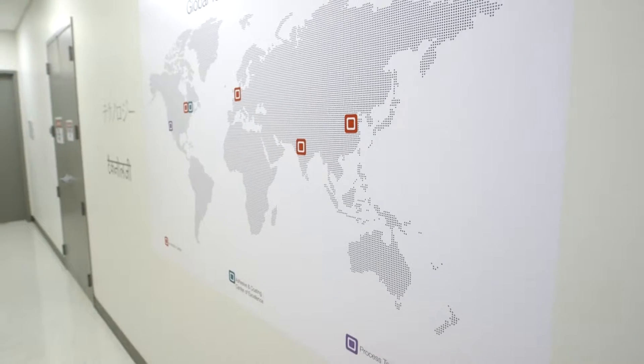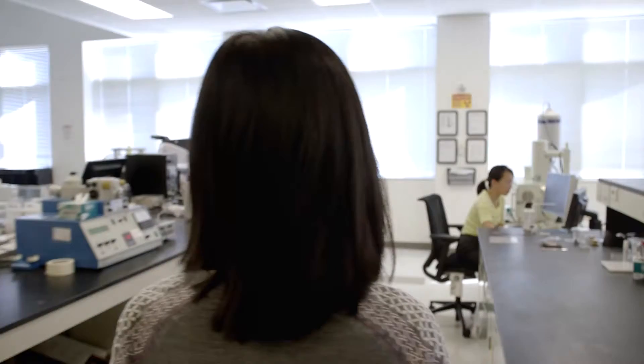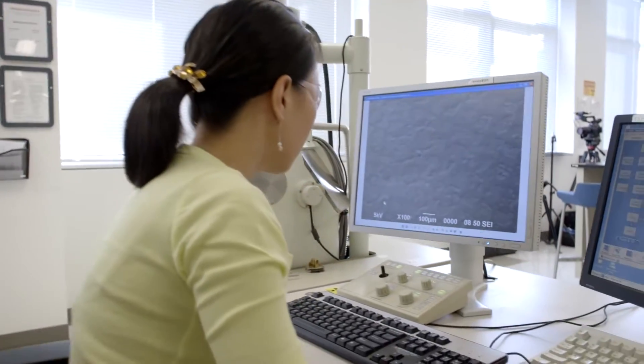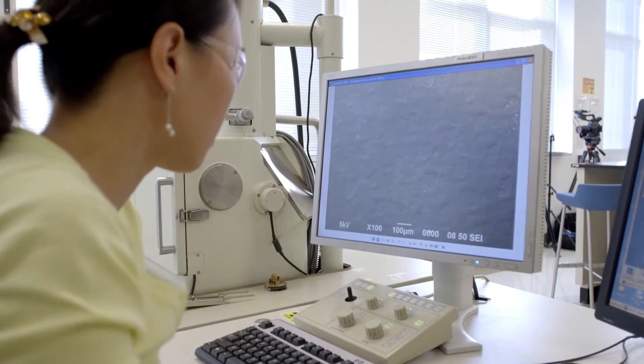We begin in the analytical lab, where our scanning electron microscope views images at 300,000 times that of the naked eye.